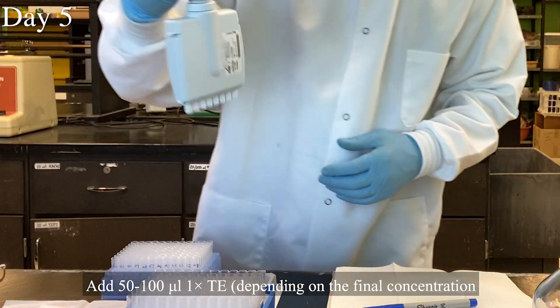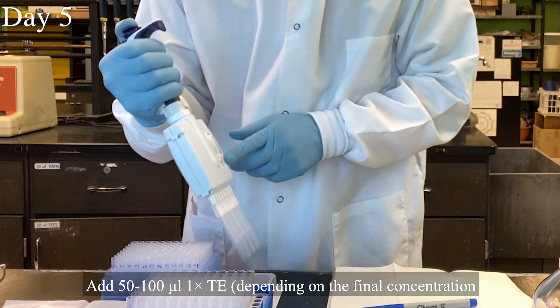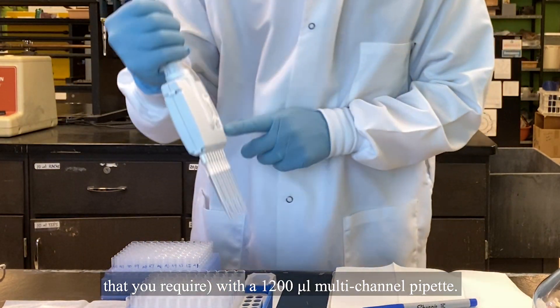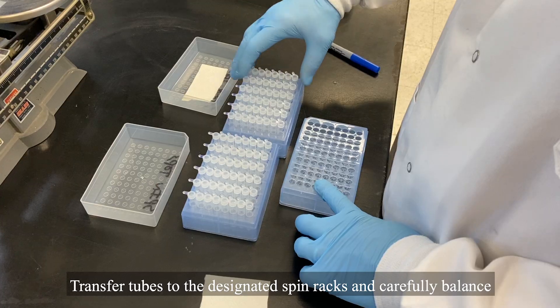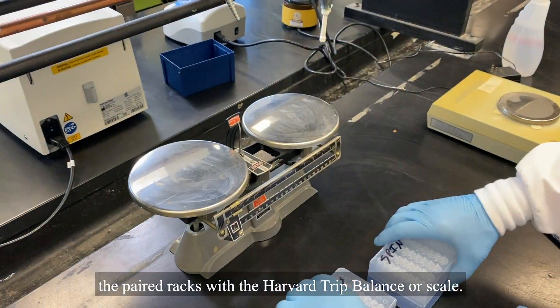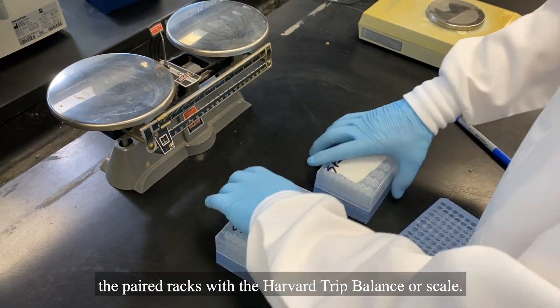Add 50 to 100 microliters 1X TE, depending on the final concentration that you require, with a 1200 microliter multi-channel pipette. Transfer tubes to the designated spin racks and carefully balance the paired racks with the Harvard trip balancer scale.